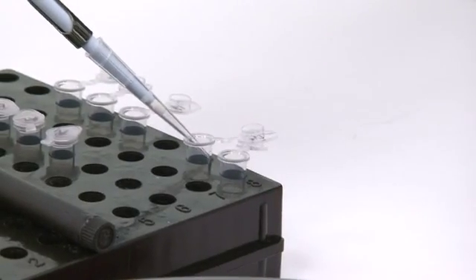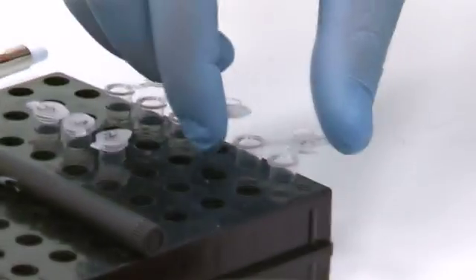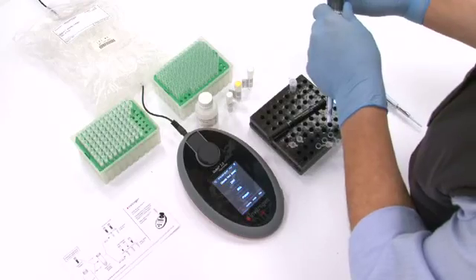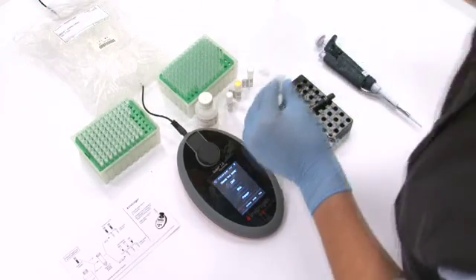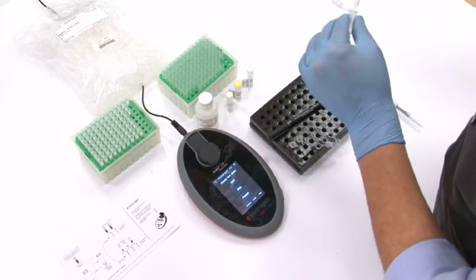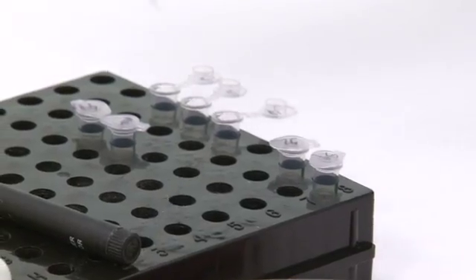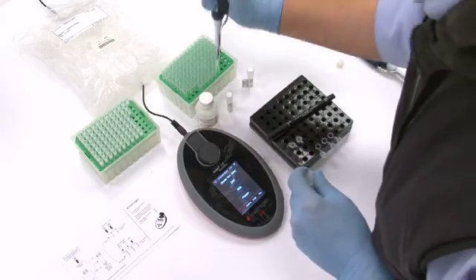For the DNA sample, we can use between 1 to 20 microlitres of each DNA solution in an assay tube. In this case, we add 198 microlitres of the working solution, prepared previously, into our 3 DNA tubes. In each of the 3 DNA tubes, we add 2 microlitres of DNA sample and mix. We incubate the 5 tubes at room temperature for 2 minutes.